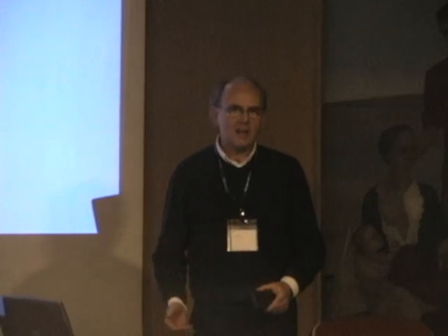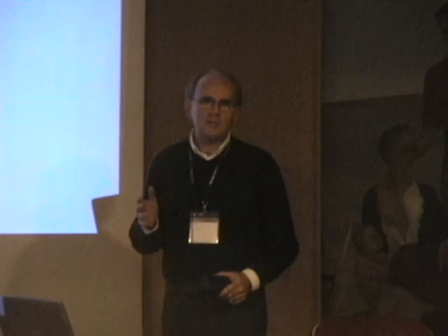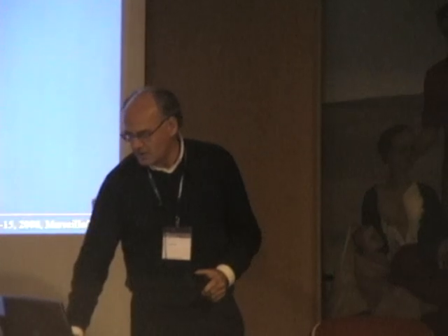One thing is to present the methods that exist, and especially some reasons why you may be interested in doing ex vivo or in vitro metabolic NMR spectroscopy, either instead of in vivo techniques or in addition to in vivo techniques. And then I would like to give you some information concerning the differences that you have to expect when you compare in vitro spectroscopic results with in vivo results. So very quick, just a few slides.